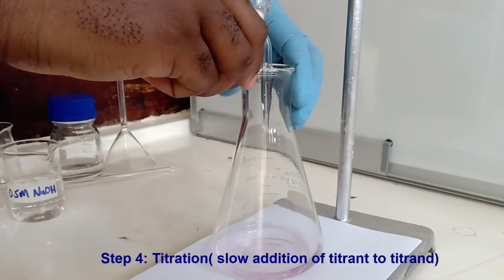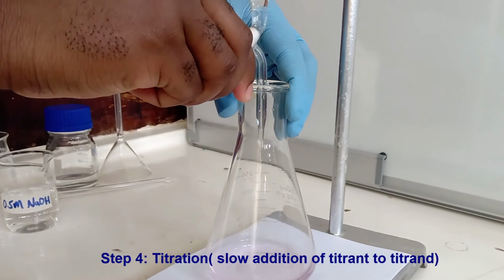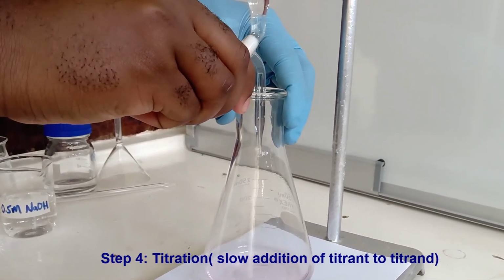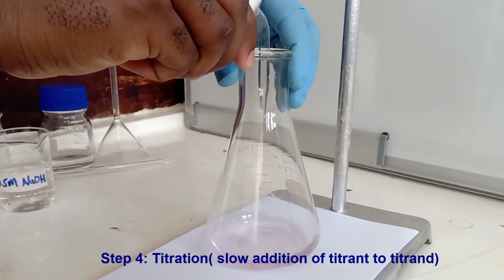Perform the titration by slowly adding the titrant from the burette to the conical flask. Gently shake the flask as you add. A white sheet of paper is placed at the bottom side of the flask. This improves visibility and quick noticing of a color change.